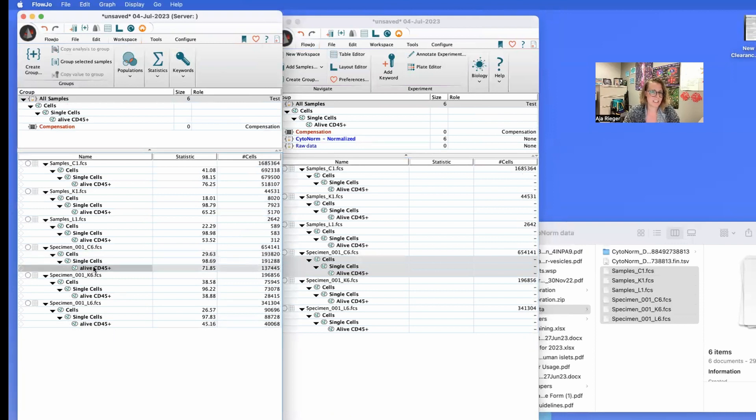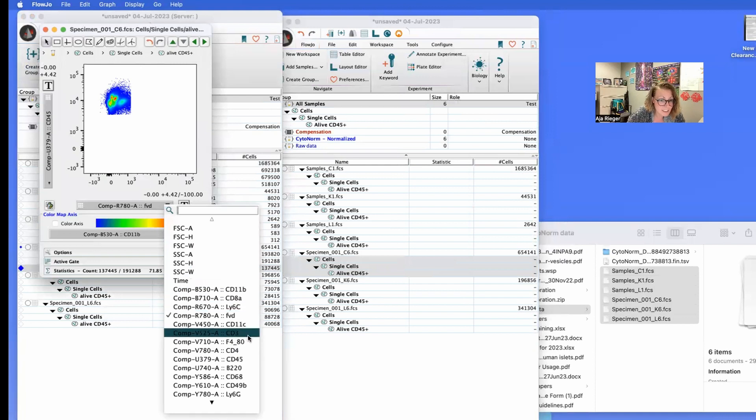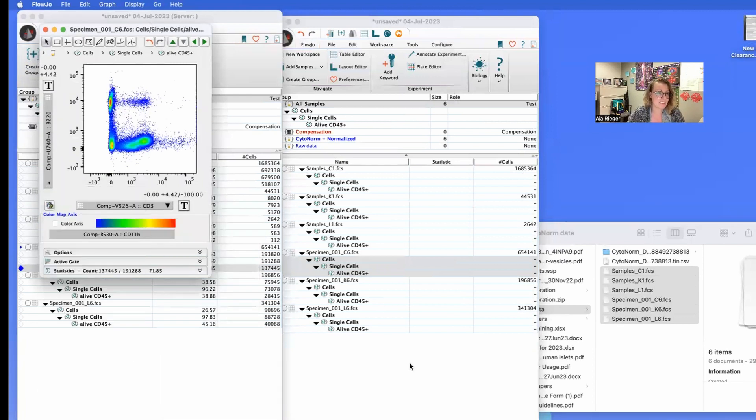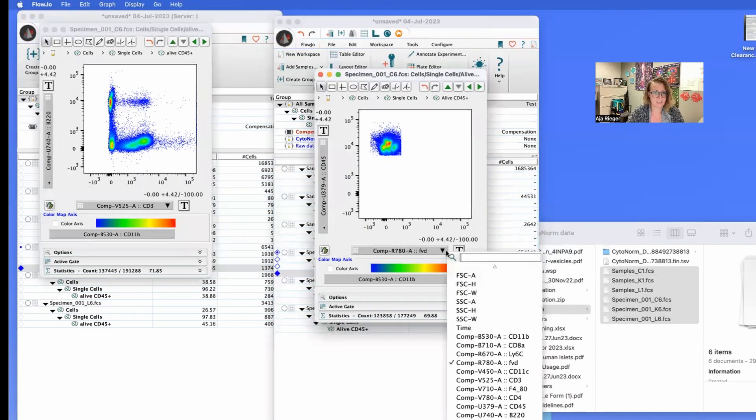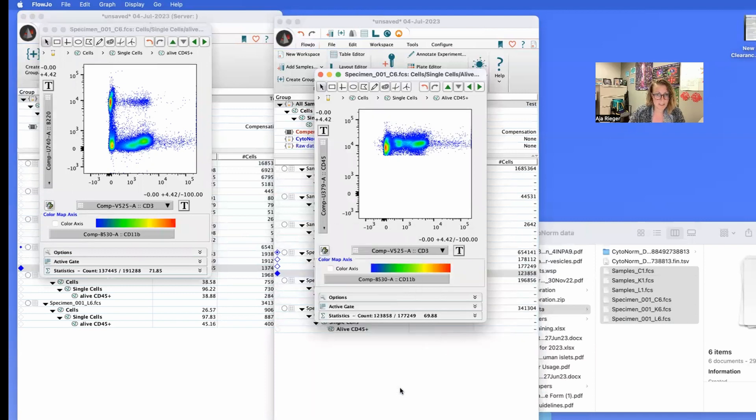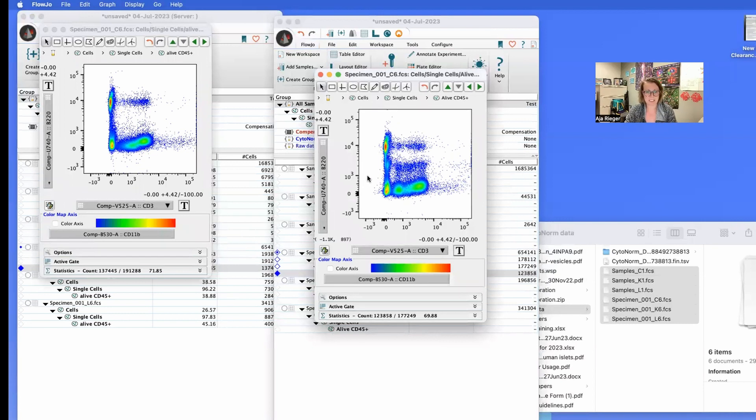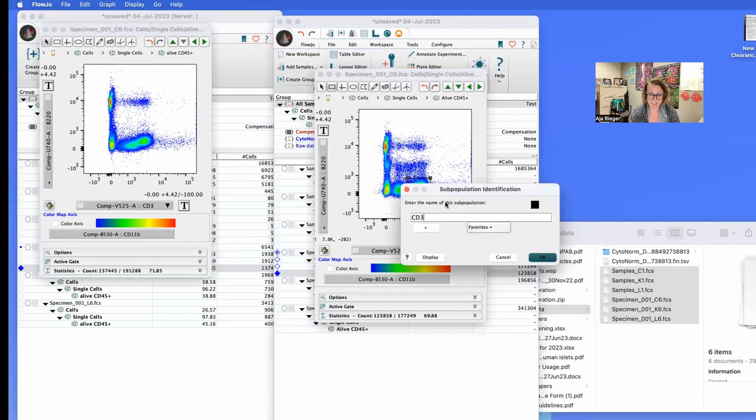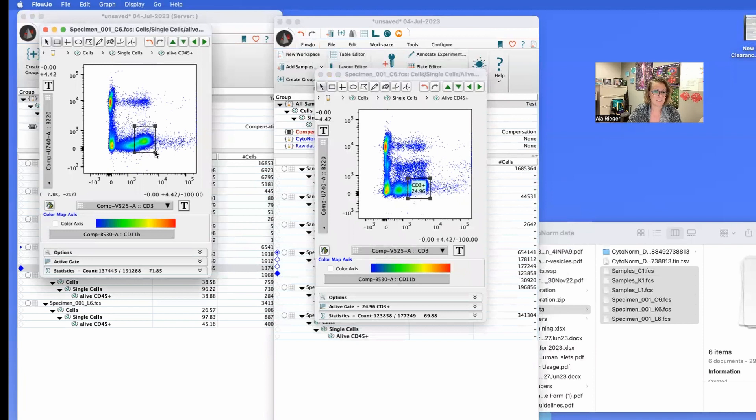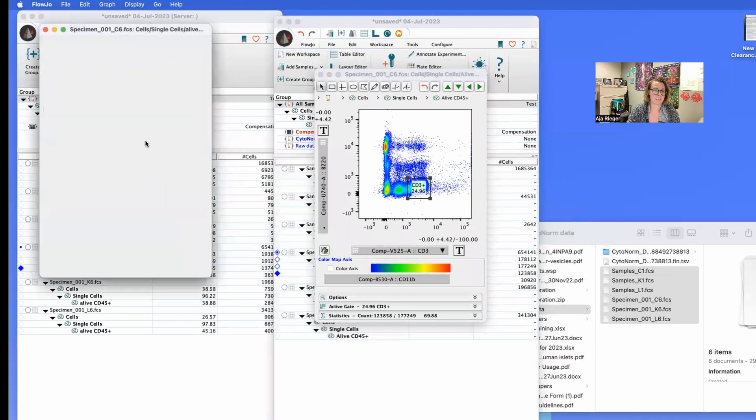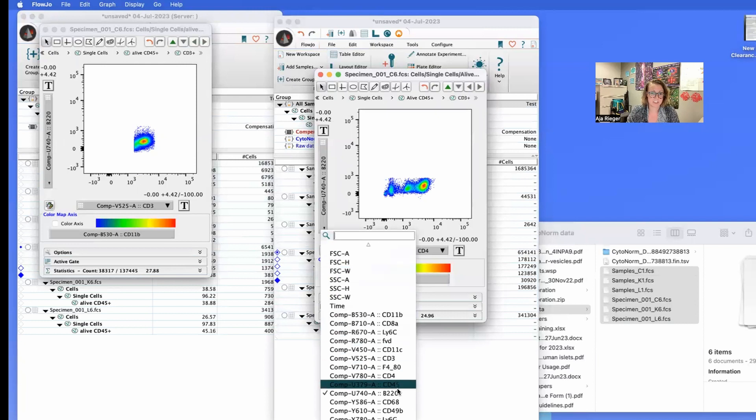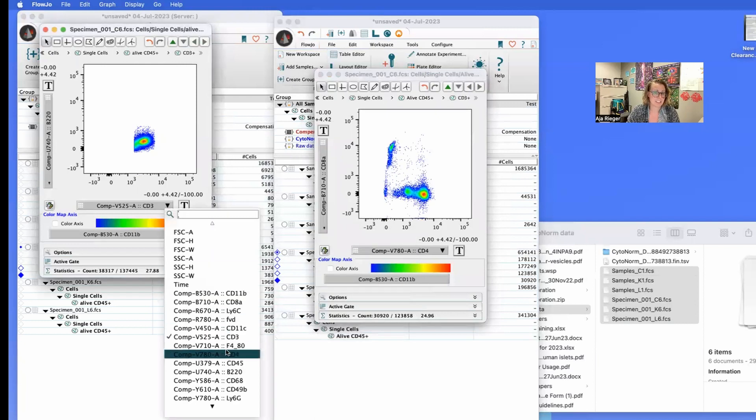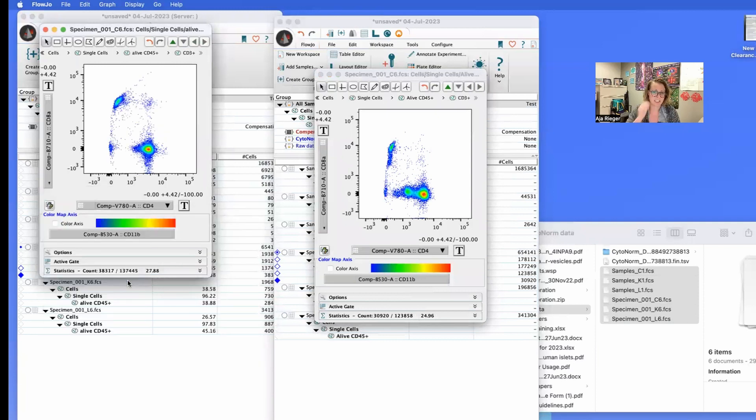So if we go with our standard, in this case, we did CD3 versus B220 and we'll do the same thing over here. So CD3 versus B220, you can see there are some slight changes in how the data looks, but overall the populations are fairly similar. So we'll gate to say our CD3 positive. Same thing over here. And go inside there and look at our CD4 versus CD8.